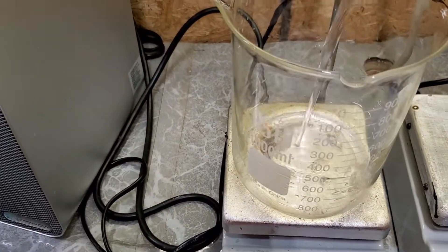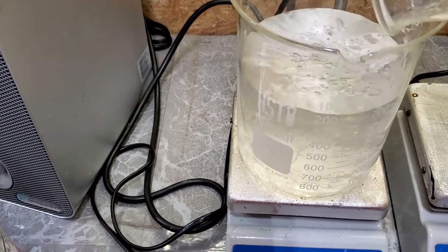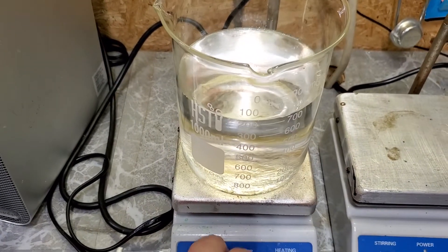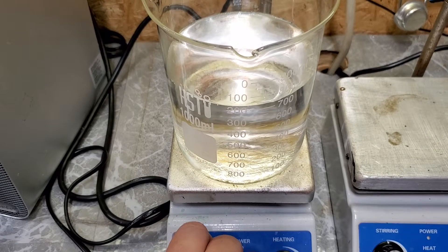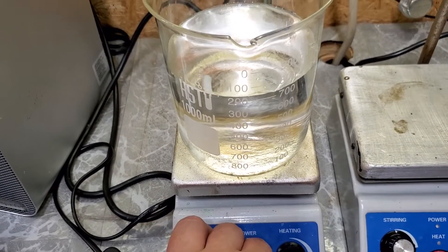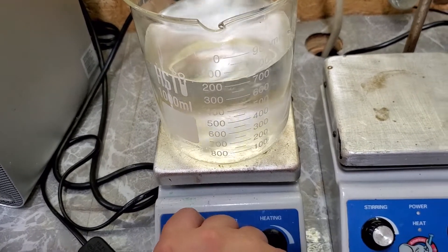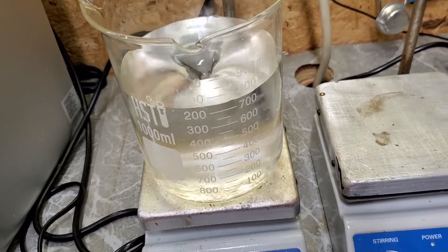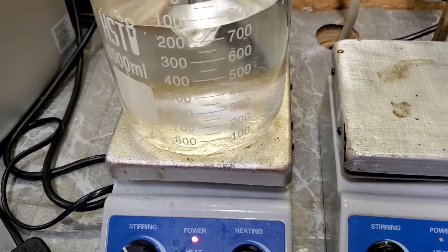Put that back on there with the water and the stir bar. Turn on stirring. Once the stir bar actually gets free from the incredibly viscous corn syrup, there we go. I'm just going to let that stir until everything is incorporated.